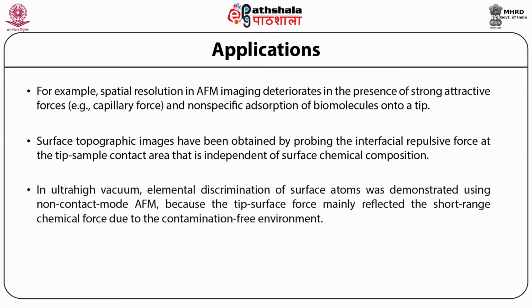In ultra-high vacuum, elemental discrimination of surface atoms was demonstrated using non-contact mode AFM because the tip-surface force mainly reflected the short-range chemical force due to the contamination-free environment.